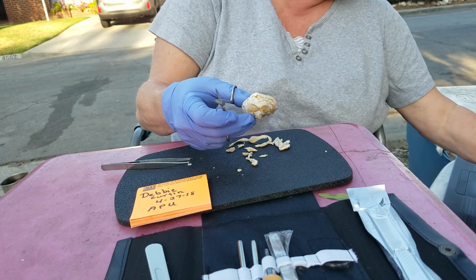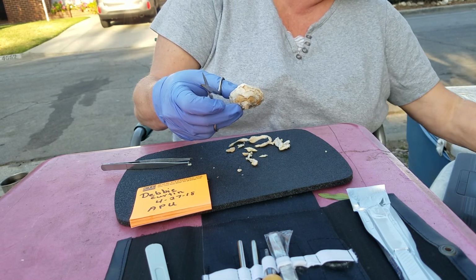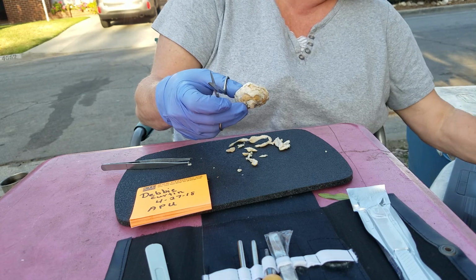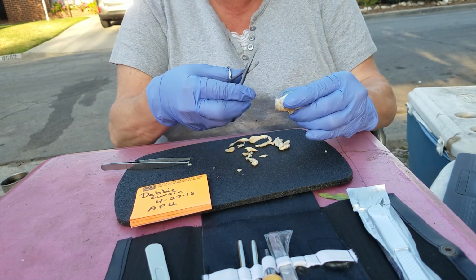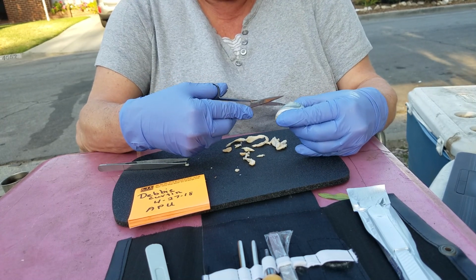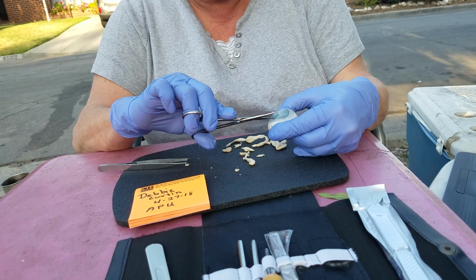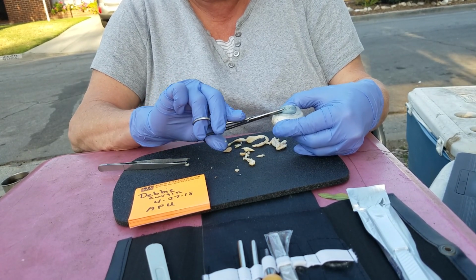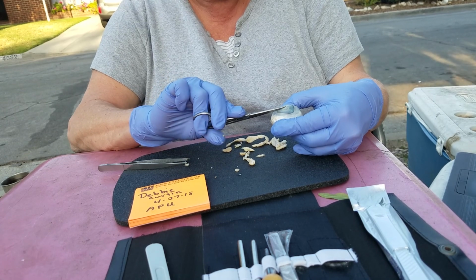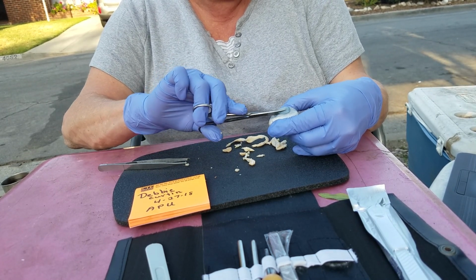So we're going to look at the anterior chamber and the retina. And I'm just going to do that with my scissors. I'll be able to separate it. You can see that it is dry, wrinkly. I'm expecting I might get a little bit of fluid here when I make this incision. Nothing has come out, so that's good.